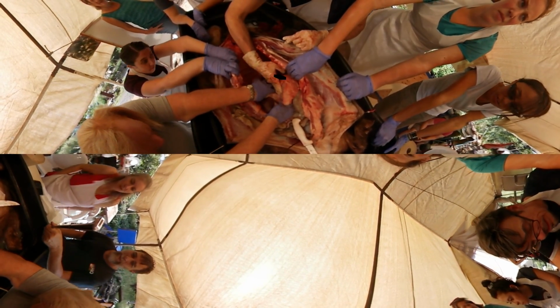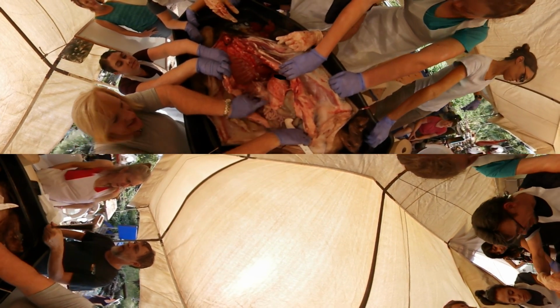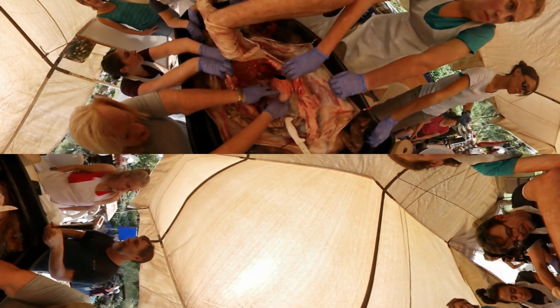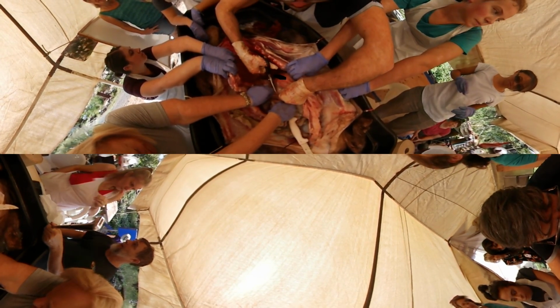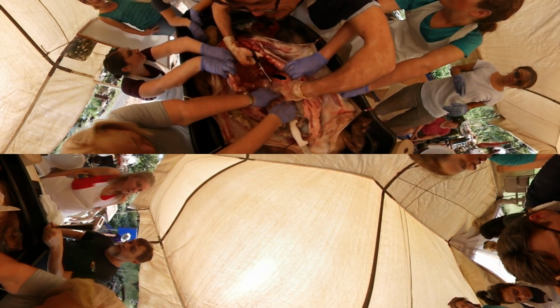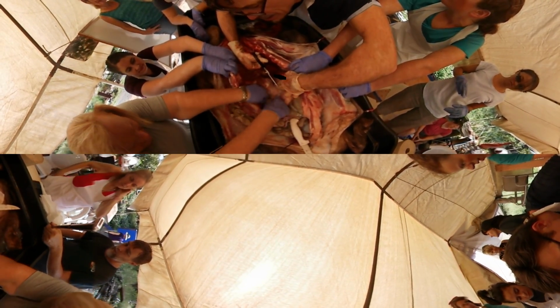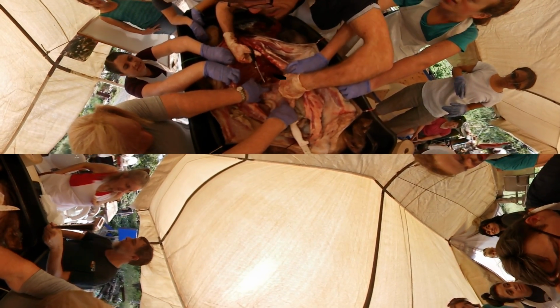The pancreas could be quite tough to locate, actually. I think it's under all of this. I think it's over here. Let me just kind of loosen this piece out. Get through this layer here.